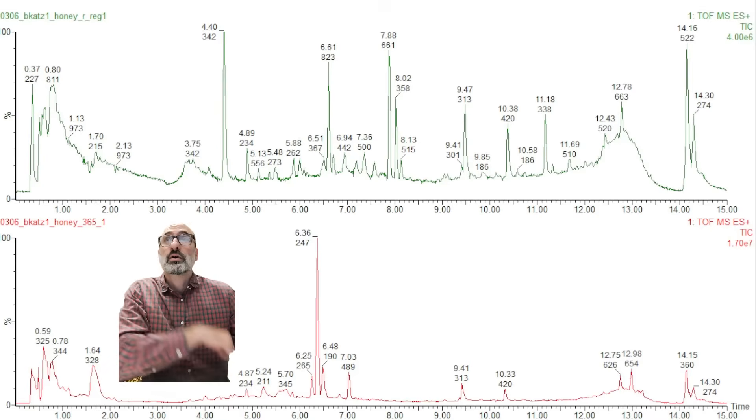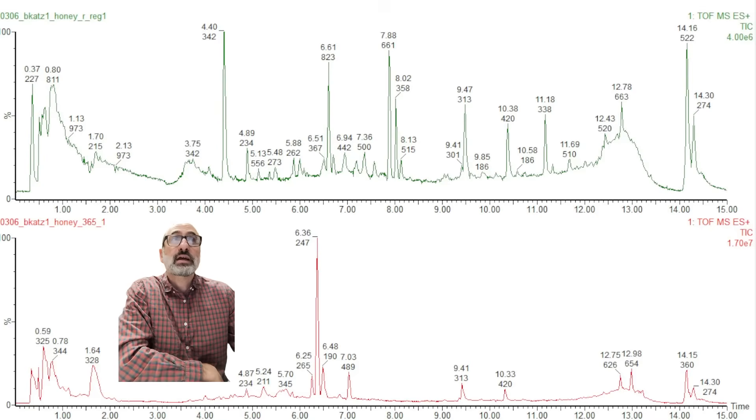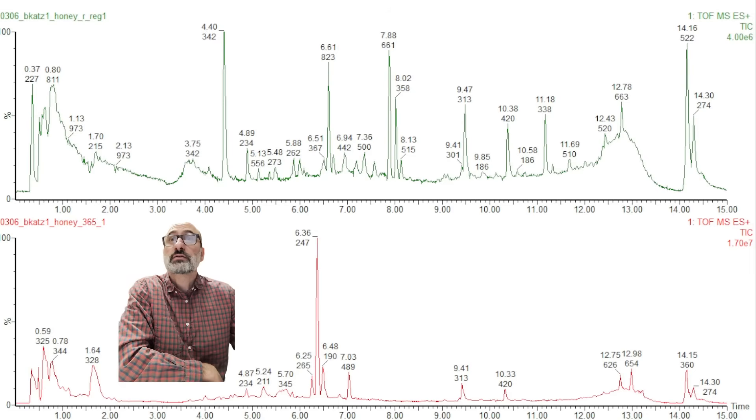All right. Here it is. Zivo Q-TOF data, positive mode, run out on the phenyl hexyl column, which is really good for sugars and phenolics and things like that. But on the bottom, you can see we have the 365 honey, not a ton of peaks, just this 247 peak that we see in a lot of honey.